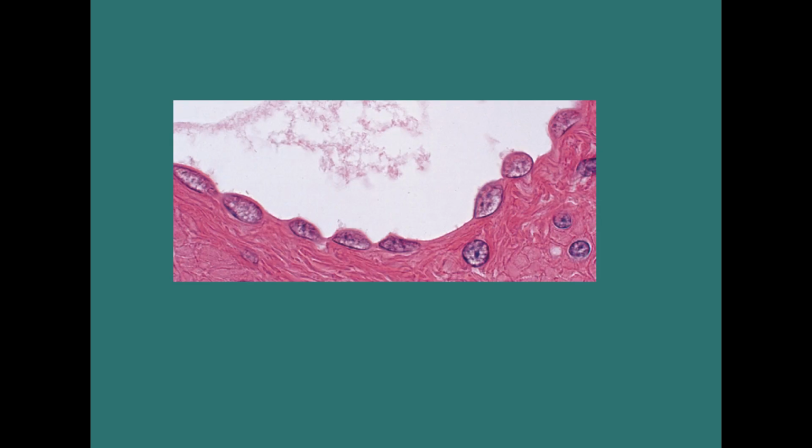Let's jump into some tissues here. Now, take a few seconds, look at this tissue and tell me or think about what it is that you are looking at, and think about how we identify epithelial tissues. So do you see layers, and do you see any specific shapes of cells?